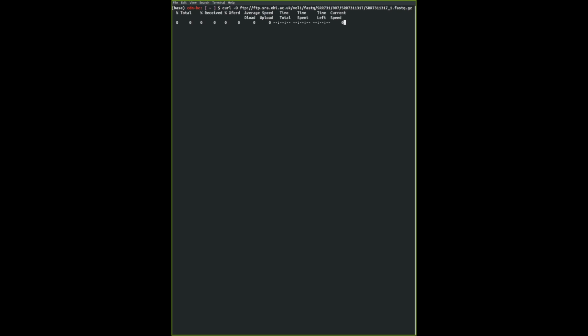You can do this, it will take some time, not too long, maybe about a minute. I'm currently in the home directory. I shouldn't be here. I meant to actually go into the FASTQ directory, but if you've done this, it's fine. We will copy the file that you have into the FASTQ directory in a bit, and then we'll do this together.